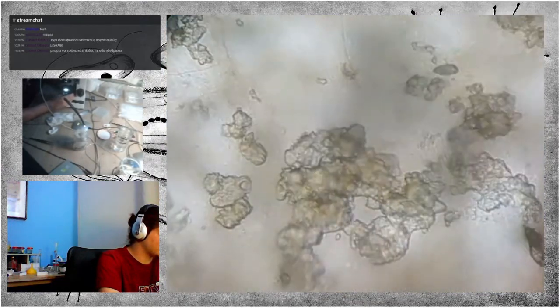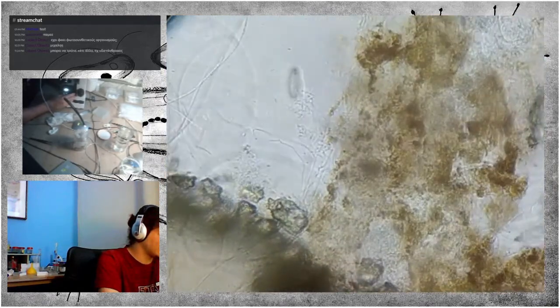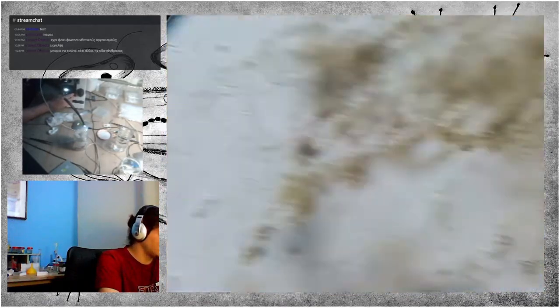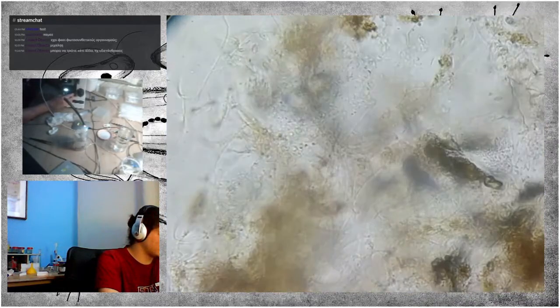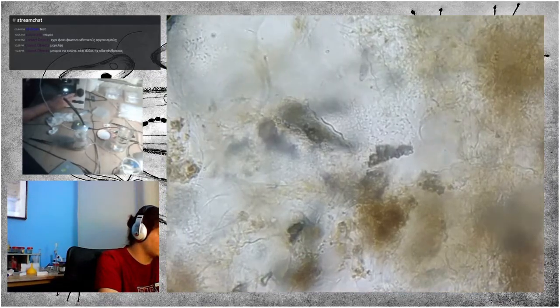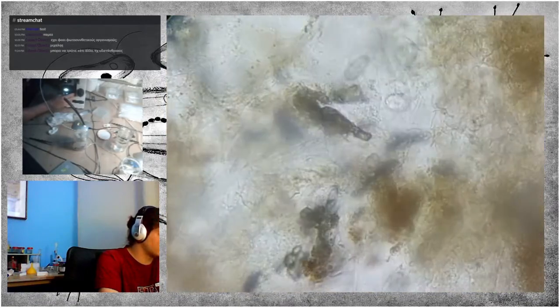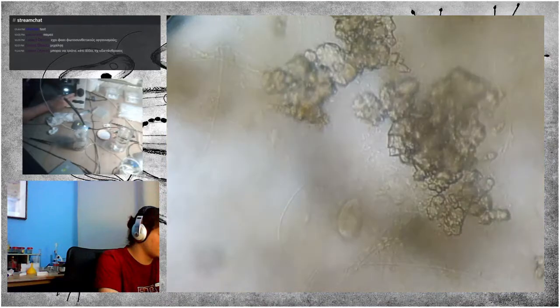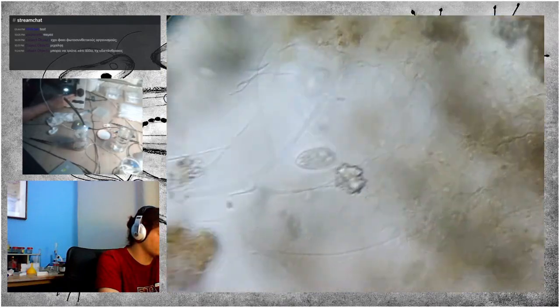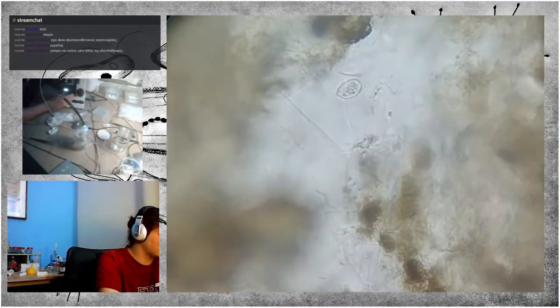Unfortunately, if there is stuff blocking the light, you cannot see very well. Even if they are transparent, it makes the light refract in a certain way, which basically does not allow you to see much detail, if you can see here.